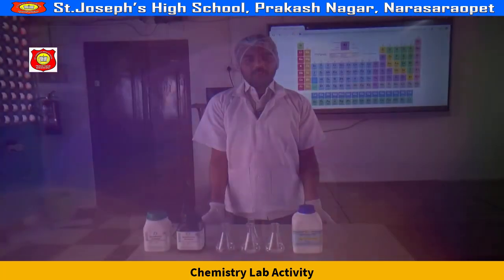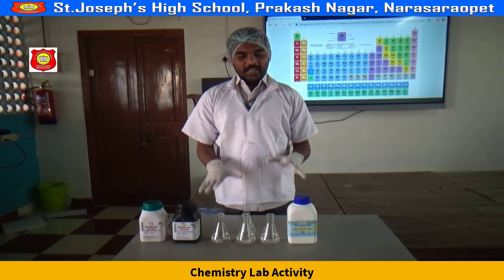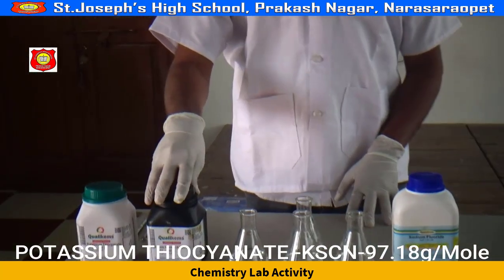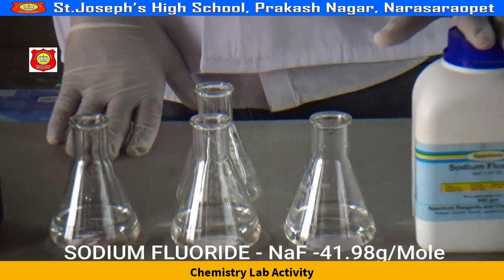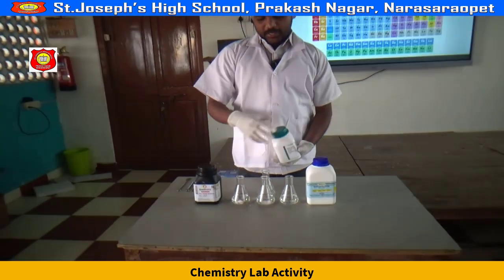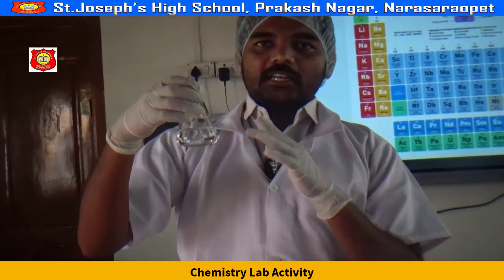Again, this is Premchand, IIT Chemistry faculty. As I said earlier, we are going to do the practical explanation of the fake blood. The chemicals which we require are potassium thiocyanate, ferric chloride, and, to make the solution disappear, sodium fluoride, acting as a dissociation agent. Now we are going to add the chemicals into this 100 ml conical flask, already filled with distilled water.